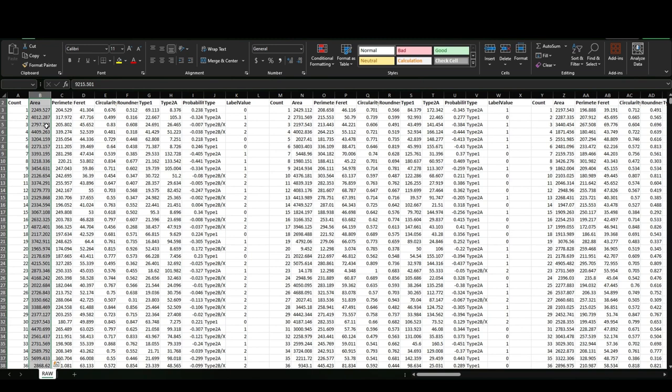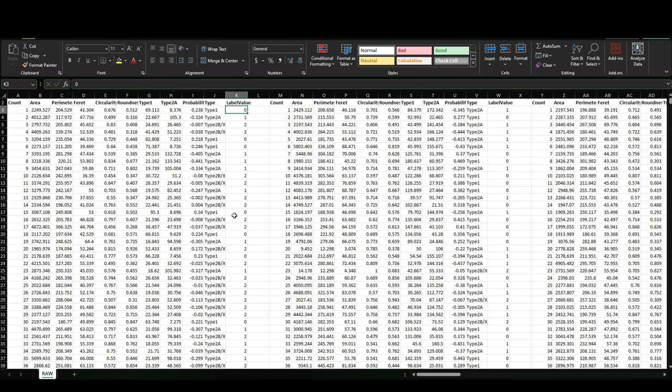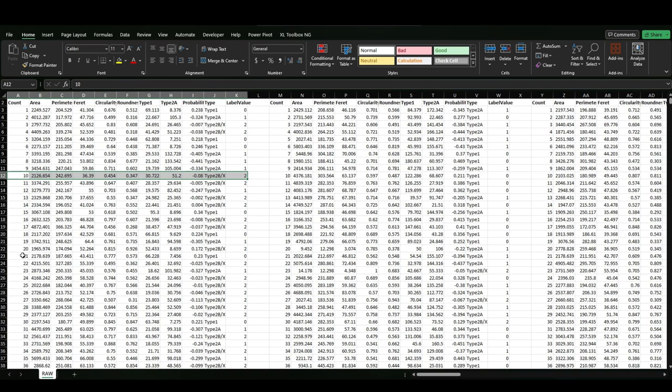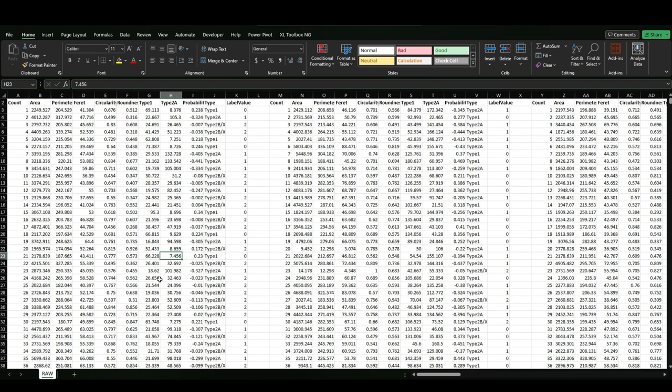You also have the fluorescence intensity and the fiber type that has been attributed, because we are on the third pipeline export. This is the label value that corresponds to the different type according to the previous column. So, as written and shown in our publication, the subtraction between the different fluorescence intensities for each fiber is able to give a putative fiber type.